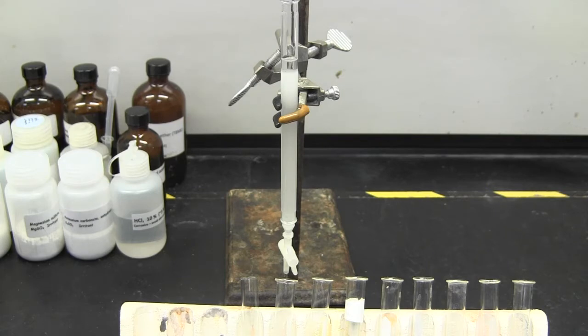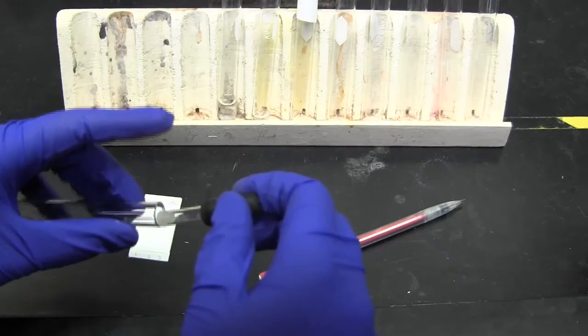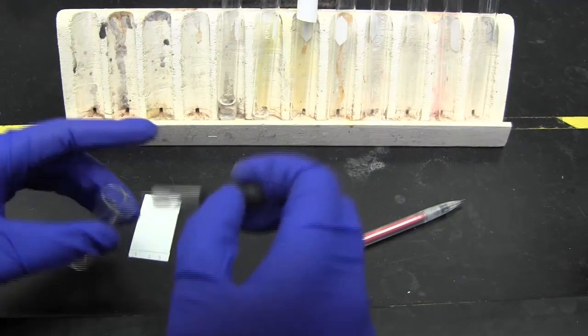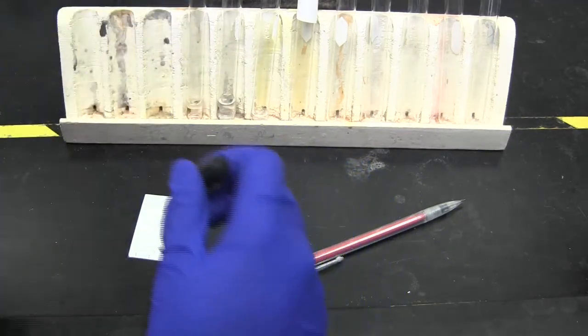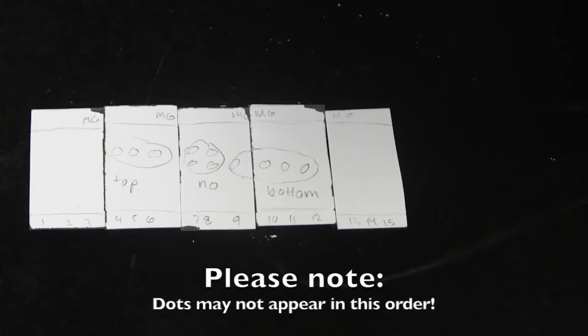Collect one milliliter fractions in test tubes and test each one on the TLC plate. Test three fractions on each TLC plate and be sure to number each sample. One compound will elute first and the other will come out after, so continue collecting fractions until spots stop appearing under the UV light.